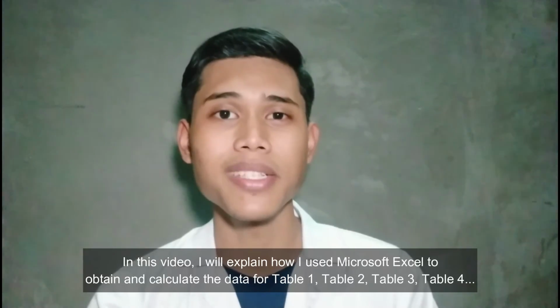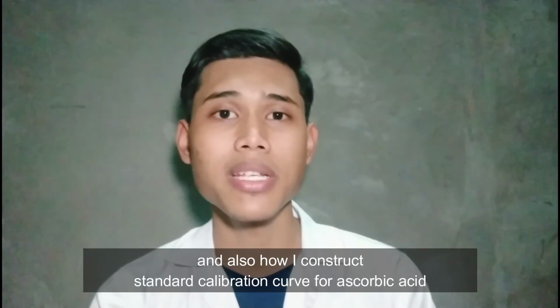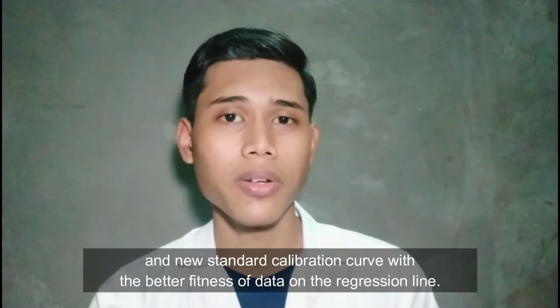In this video, I will explain how I use Microsoft Excel to obtain and calculate the data for Table 1, Table 2, Table 3, Table 4, and also how I construct the standard calibration curve of ascorbic acid and a new standard calibration curve with a better fitness of data on the regression line.